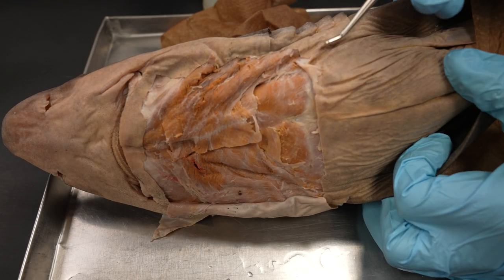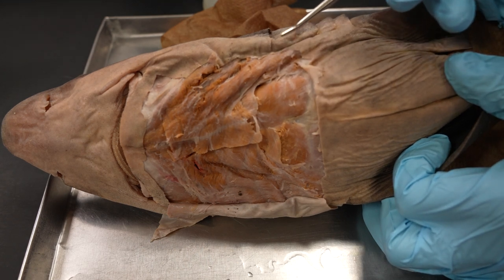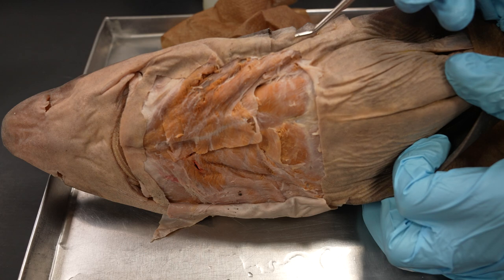Hi everyone, this is a walkthrough of the branchial and cephalic musculature of the shark. If this is not the place you intended to be, back out now.